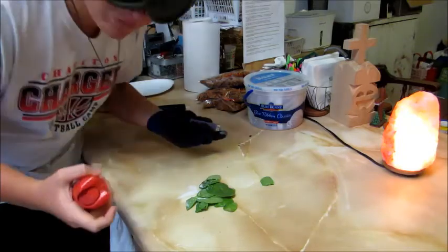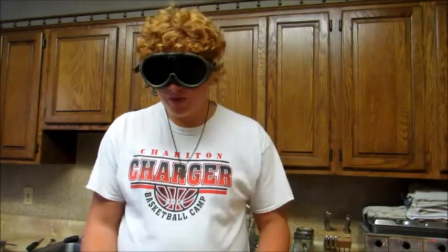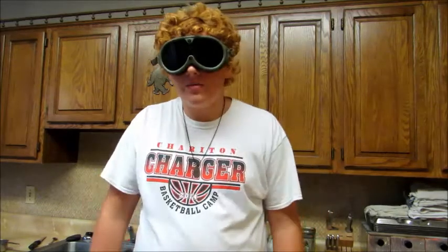Well, don't smell the fumes anyway. Always be safe with chemicals in the lab. Never inhale them or mess with them or mix them together unless it's part of the experiment the teacher is supervising. Otherwise, stay away from them. Don't mix them together in the same beaker hoping to make some cool explosion, because you might end up killing yourself.